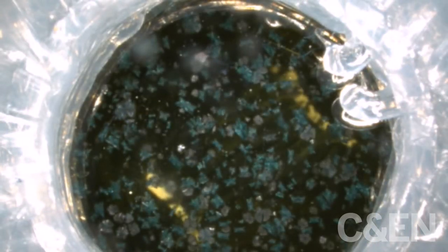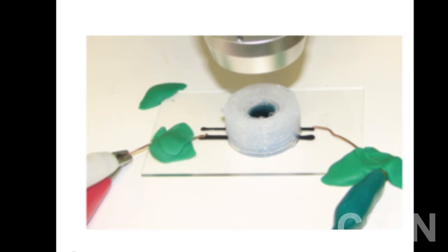In another demo, Cronin and coworkers made the reactor part of the reaction by printing electrodes into it. These electrodes, made of a conductive carbon black paste, enabled the reactor to perform electrochemistry.